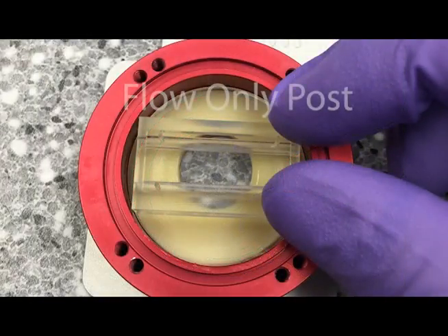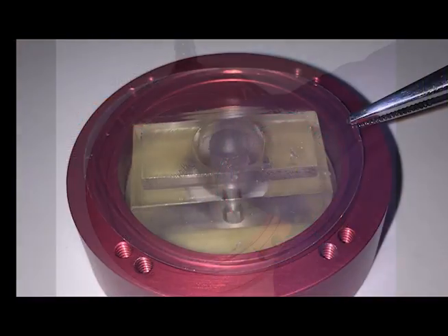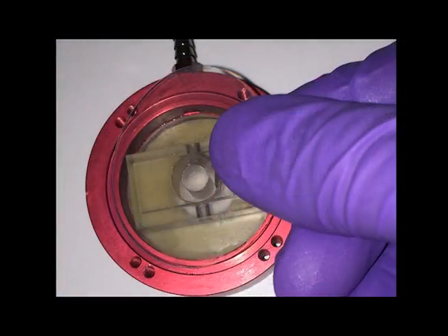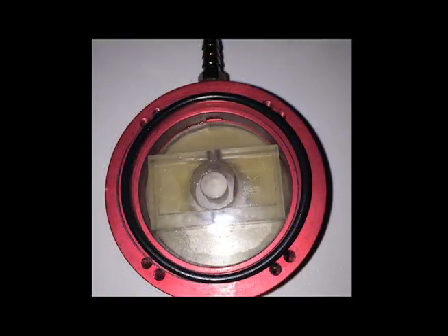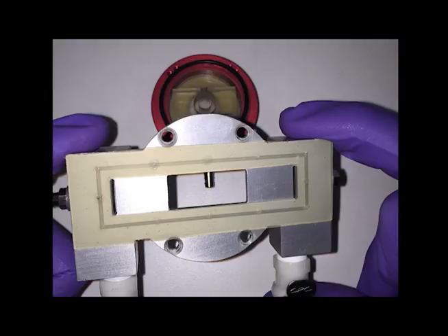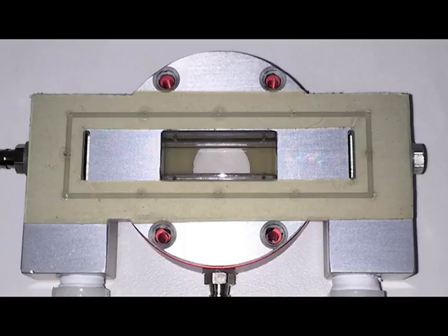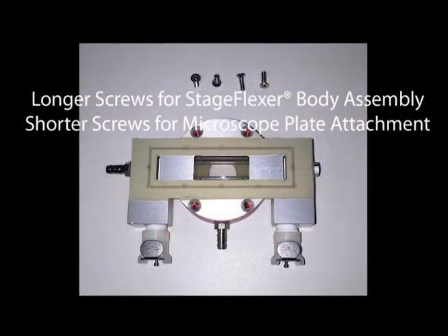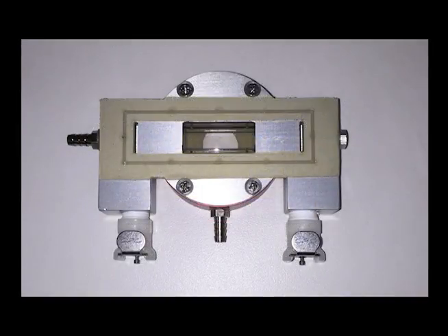If you are using flow only, use the flow only post. Apply a thin layer of lubricant to the top of the loading post, then carefully center the stage flexor membrane on top of the post. Place the O-ring on top of the membrane, aligned with the groove around the top surface of the stage flexor body. Place the FlexFlow body on top of the O-ring, aligning the rectangular hole with the rectangular shape of the loading post. Place the four screws into the four holes in the FlexFlow and tighten until the membrane is fully clamped and flushed with the top surface of the FlexFlow body.